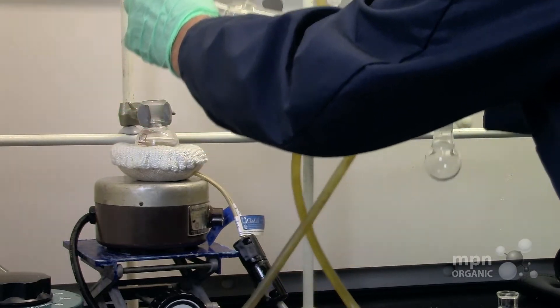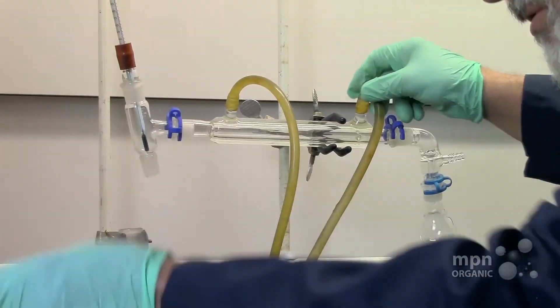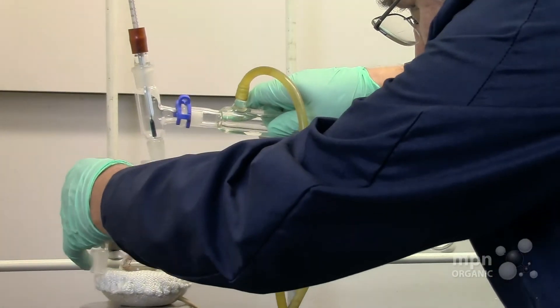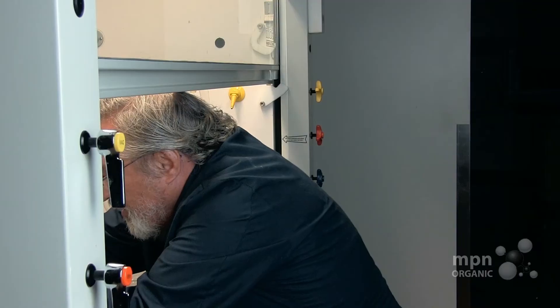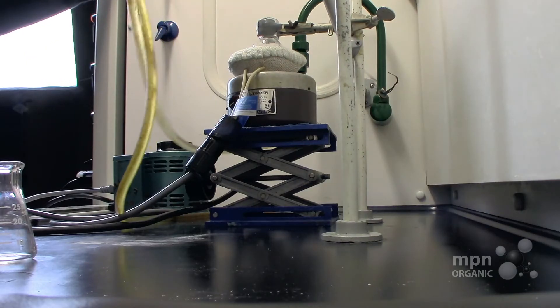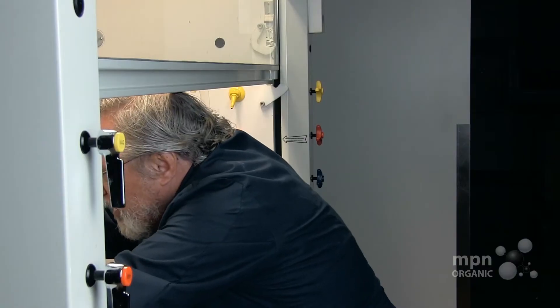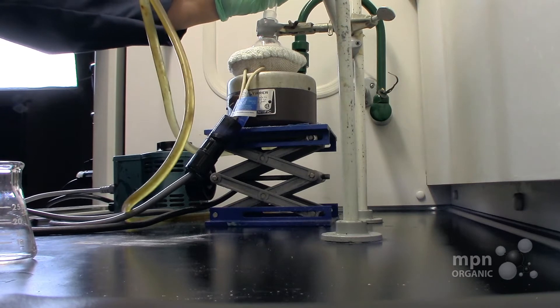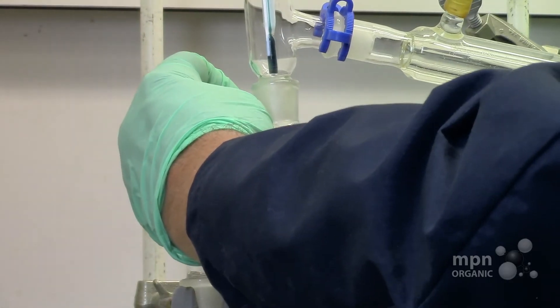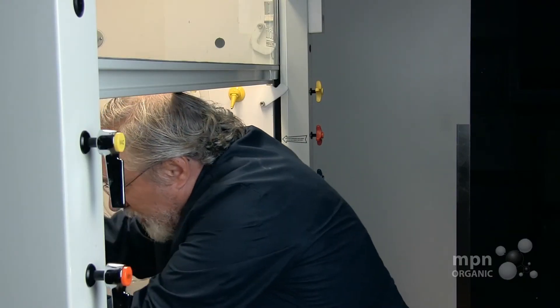I'll show you how that works. You can raise this up. Let's raise this a little bit further up. That's going to be like that, and now we're going to lower this down so that it fits like that. So that the connections are about the same.